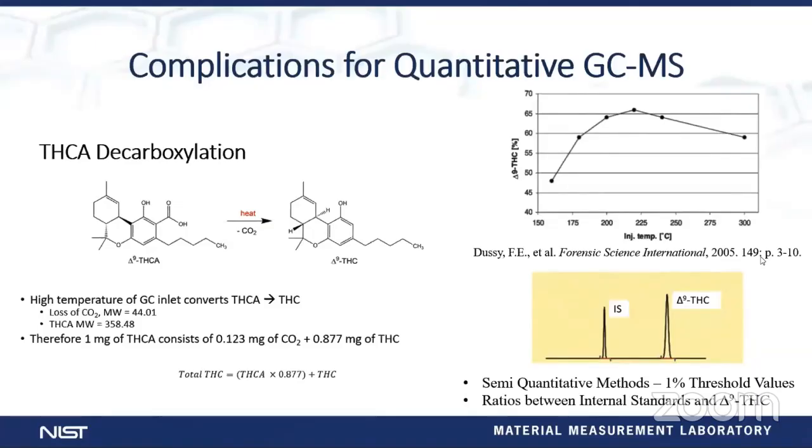If it's lower than that, it's considered hemp. They're using 1% to really account for the variation you could see from sample to sample, but also because it's pretty difficult to make hemp that's below 0.3%. And of the samples I'm going to show you later on, you're going to see a lot that fall between the 0.3 and 1% range.